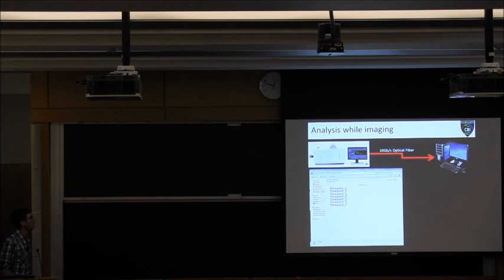And then the one last thing that I'm excited about, but I think is going to be hopefully here sooner than later, is this idea of doing analysis while you're still imaging. So it's in place now, we don't have it installed yet, but it's possible. When you're using that Arivis 4D Vision software, you have to take your CZI file off the light sheet and convert it to the Arivis file type, which is an SIS file.